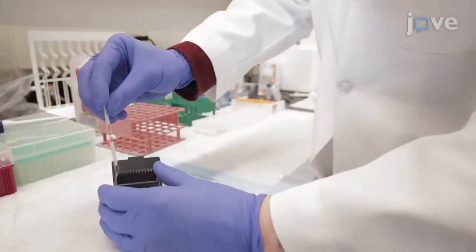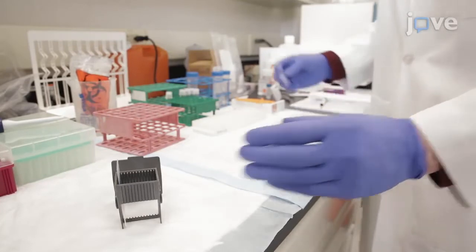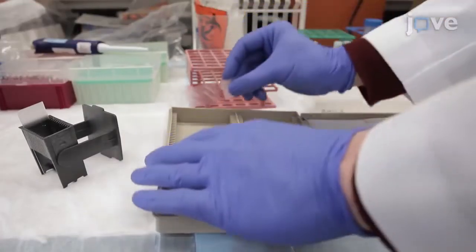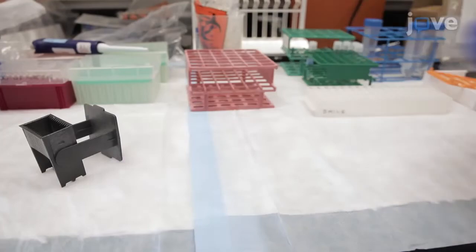When the sections have adhered to the slides, place the slides into a vertical rack for drying at 37 degrees Celsius for 24 hours. The next day, transfer the slides to a slide container for storage at 4 degrees Celsius for at least 12 hours.